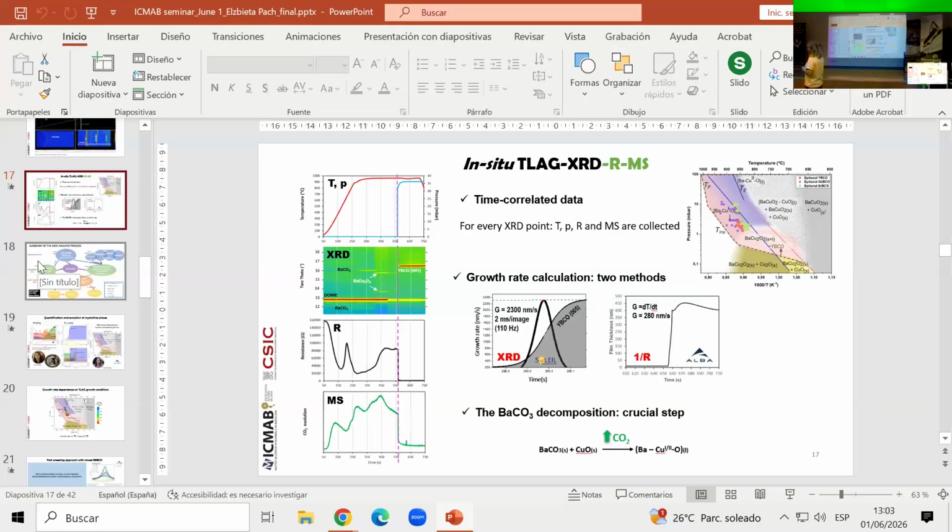Well, we can measure, because we do. The liquid is very short-lived and it's very viscous, so this also helps. And of course, we were at the XAS beamline at 60 degrees or 40 degrees, and the liquid, even though it forms, doesn't go away. It sticks to the substrate. And it doesn't really affect the contacts, because they are prepared the way that ONA does, which was optimized over a long time in order to do that well.